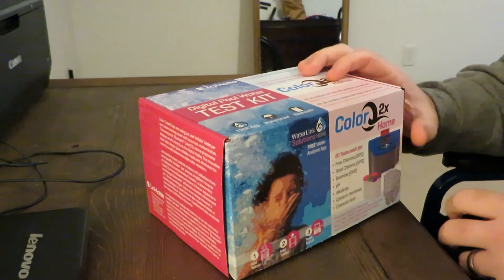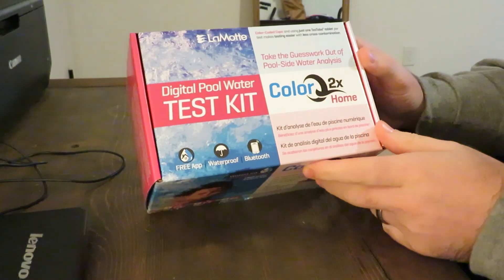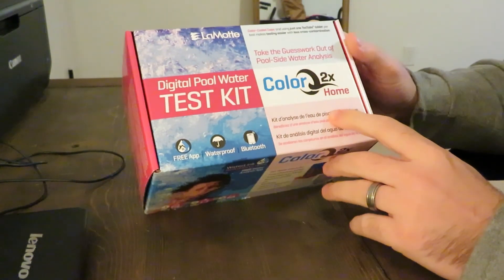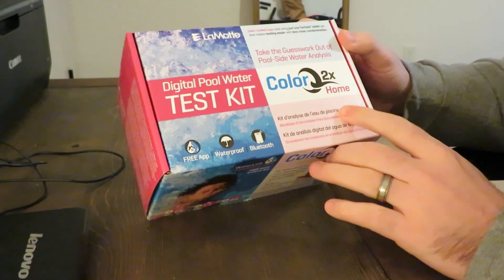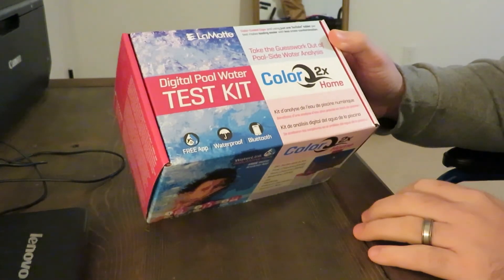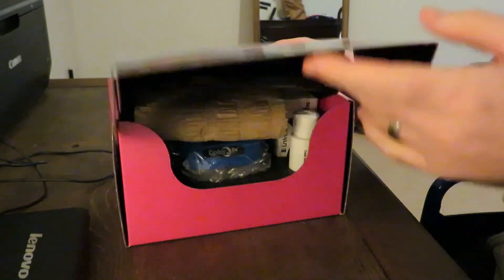Today we have the unboxing of the LaMotte ColorQ 2X, the home edition. This one is designed for homeowners. It's by LaMotte, and it's a digital pool water test kit using photometers. Let's get right in.